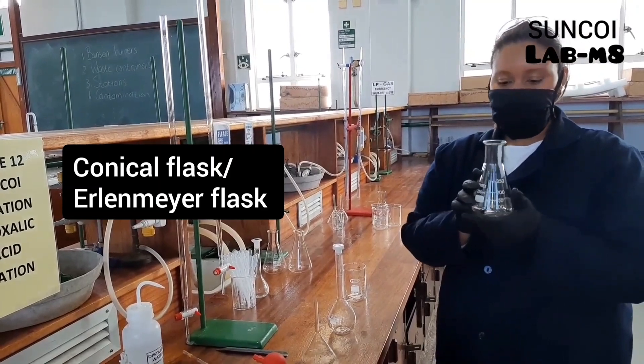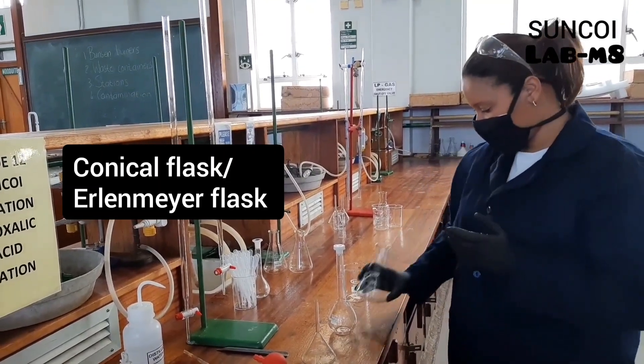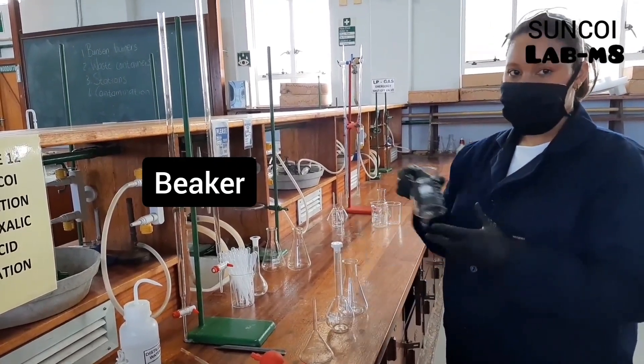This one is a conical flask, or Erlenmeyer. And lastly we have a glass beaker.